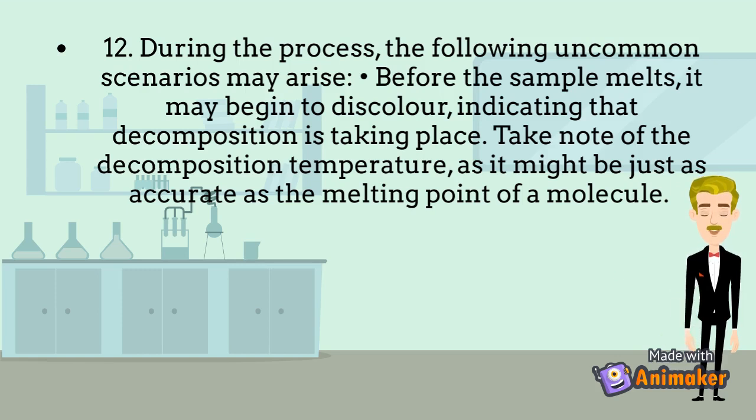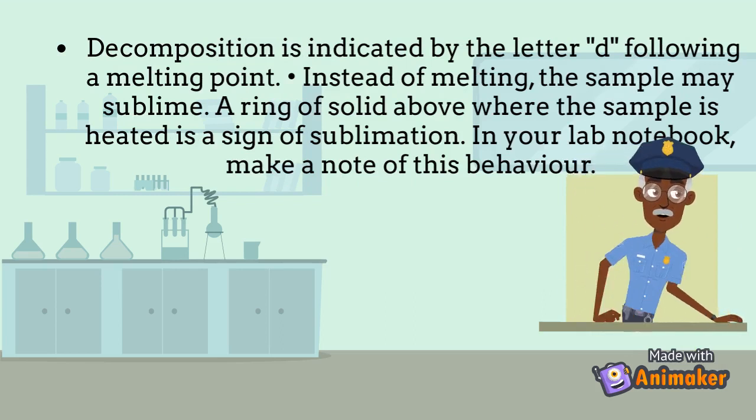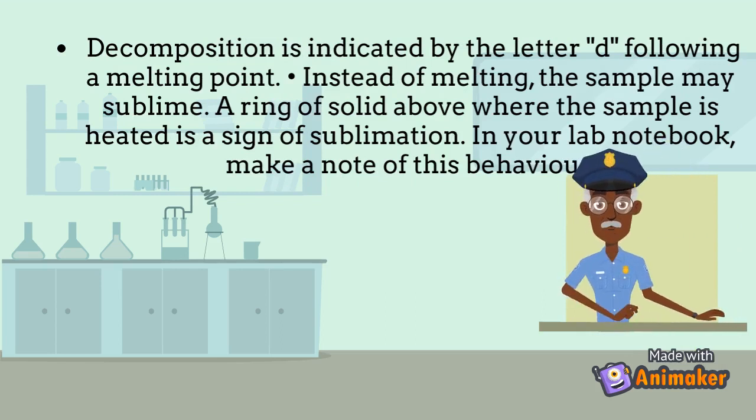Before the sample melts, it may begin to discolor, indicating that decomposition is taking place. Decomposition is indicated by the letter D following a melting point. Instead of melting, the sample may sublime, leaving a ring of solid above.